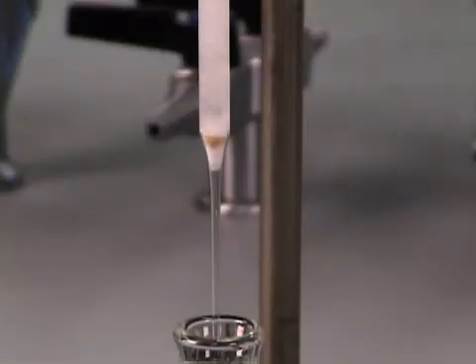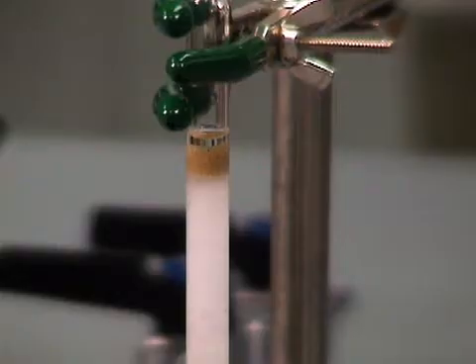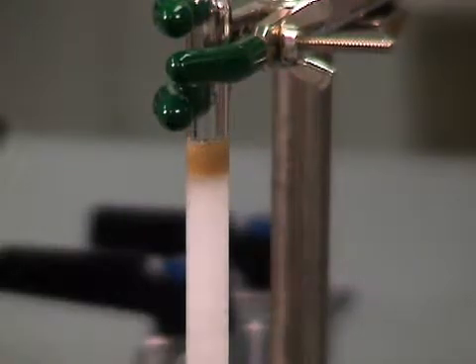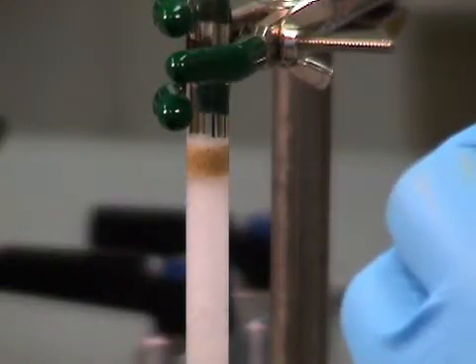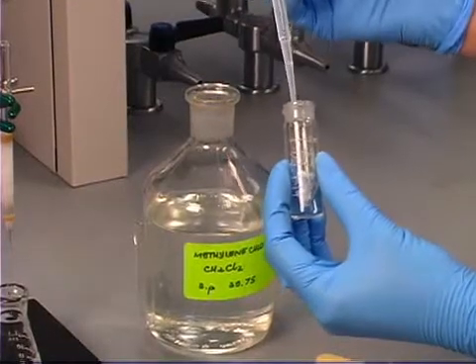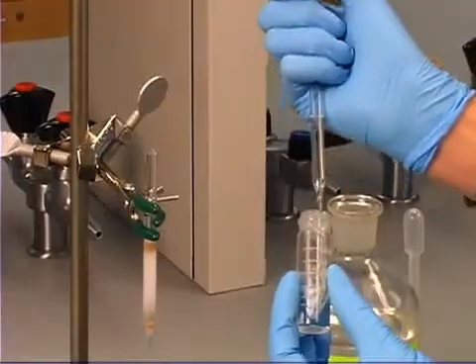Add solvent to wet the column, and allow the solvent to flow through before adding your compound. Rinse the reaction vial with additional solvent, and add this to the column.